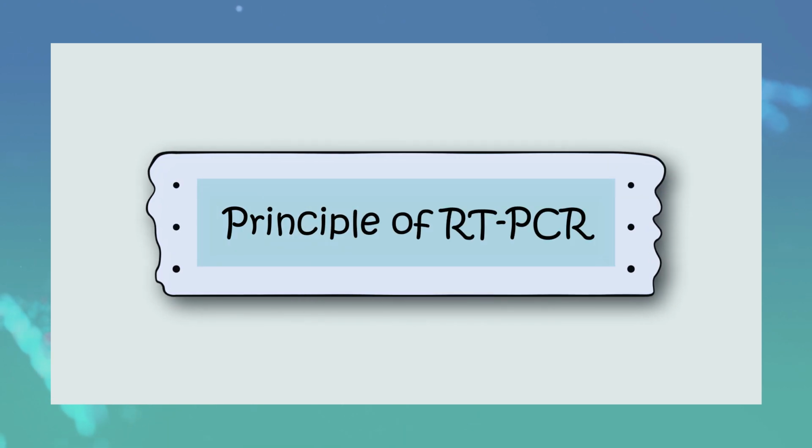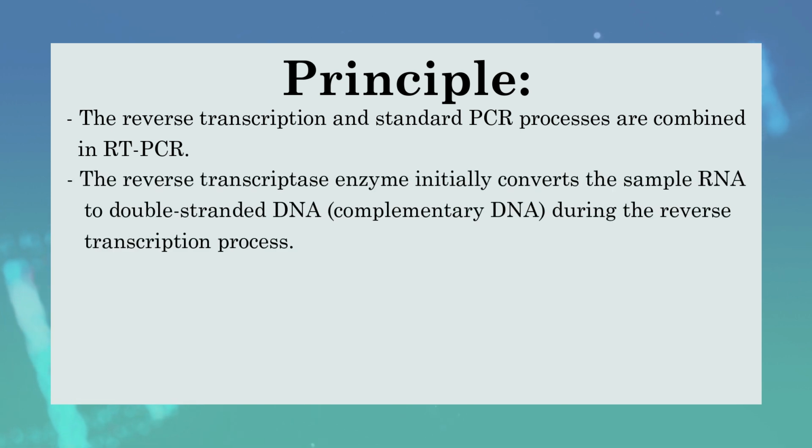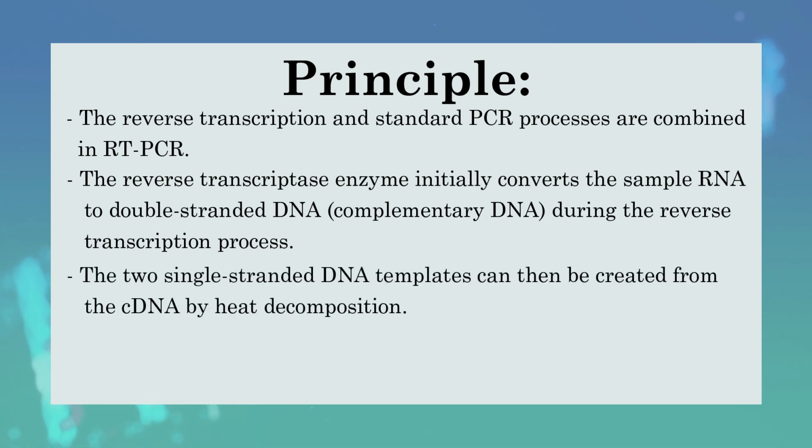The principle of RT-PCR. The reverse transcription and standard PCR processes are combined in RT-PCR. The reverse transcriptase enzyme initially converts the sample RNA to double-stranded DNA, complementary DNA, during the reverse transcription process. The two single-stranded DNA templates can then be created from cDNA by heat decomposition.